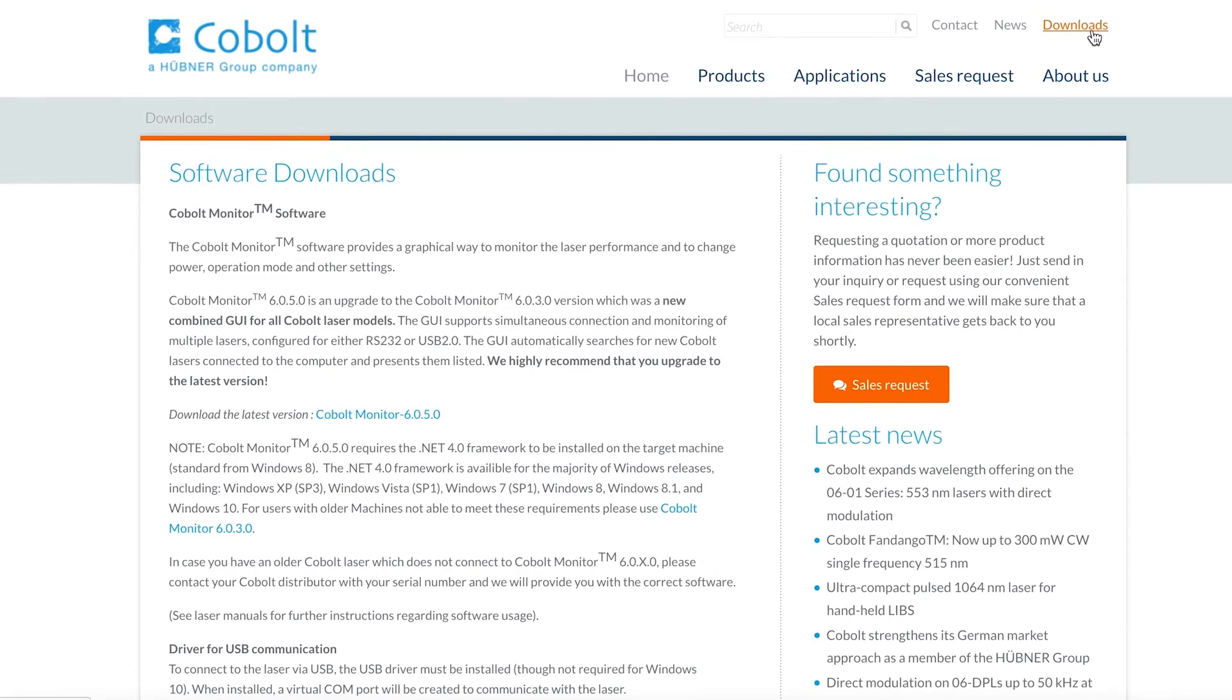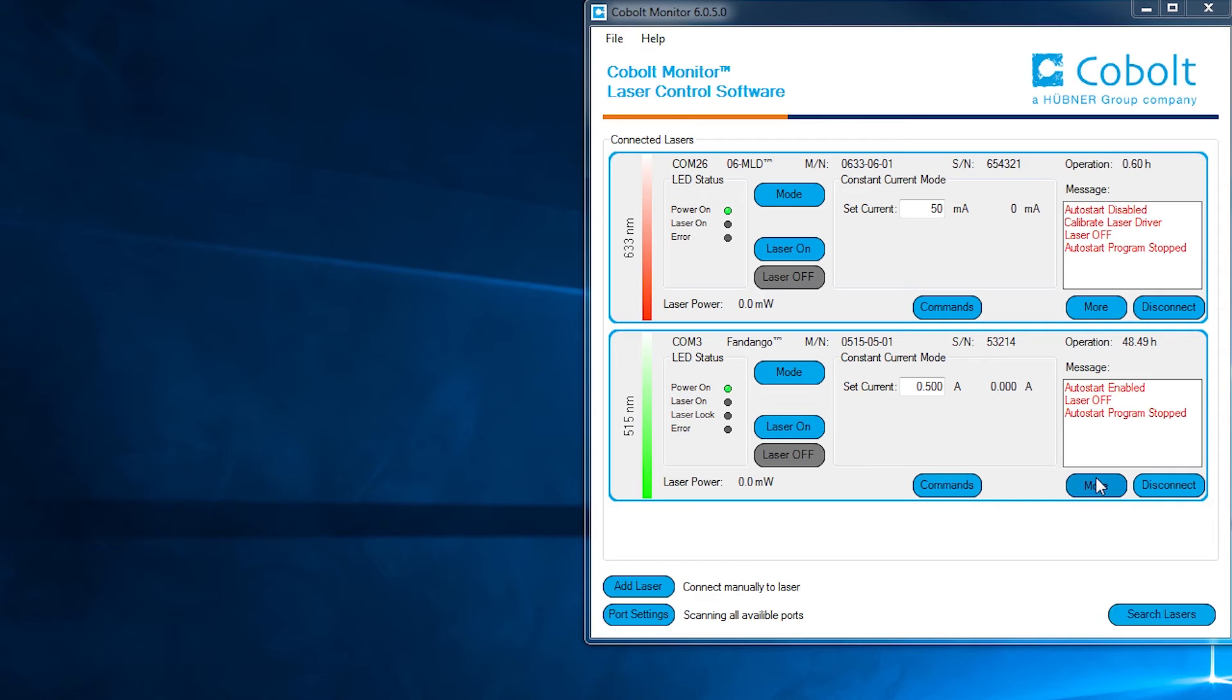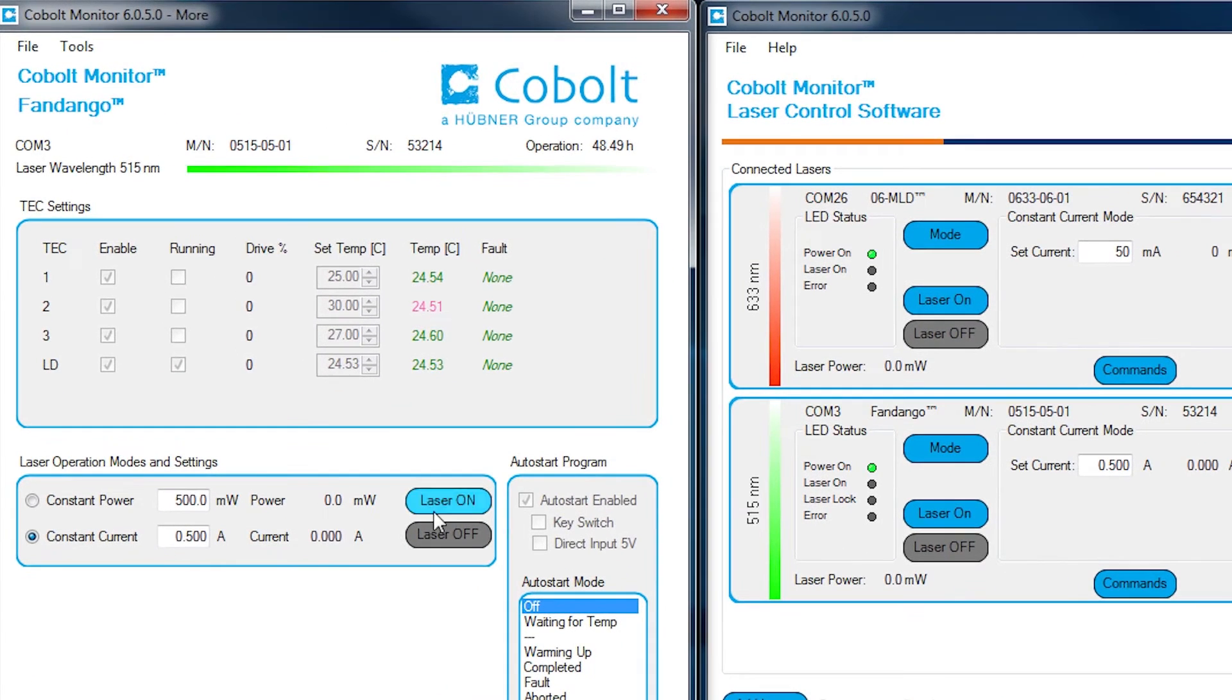The Cobalt software allows simultaneous control of multiple Cobalt lasers, which are automatically detected. Sub-levels allow more detailed parameters to be monitored.